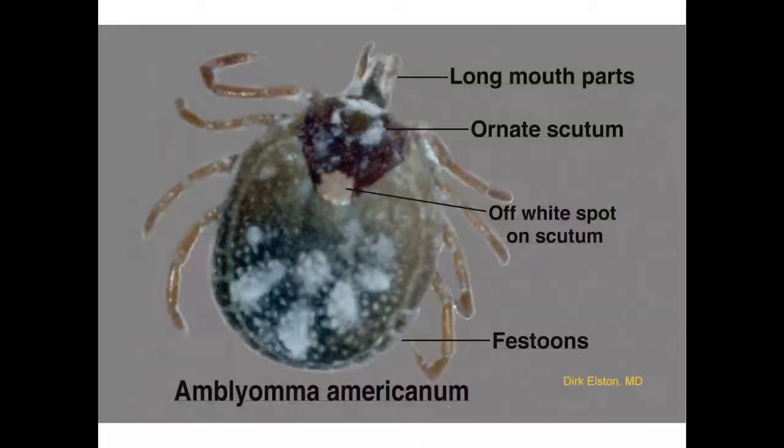Okay, and we're not entomologists, but you should have some familiarity with them. So these are just fillers, and we'll just look at them, right? So what is this one? Amblyomma americanum, excellent. Okay, Lone Star tick, female.